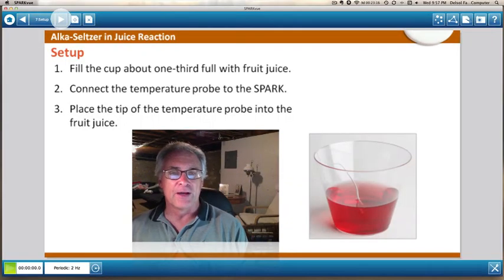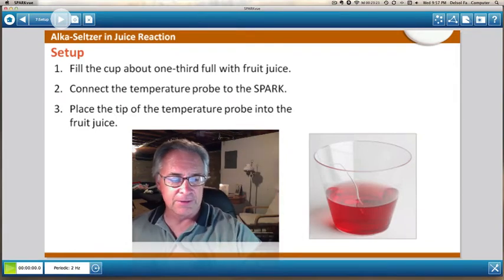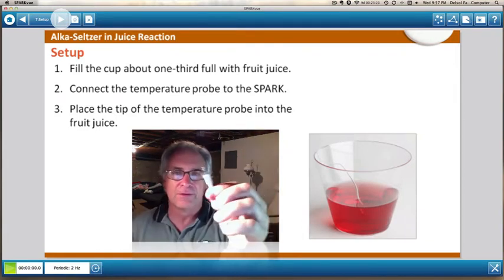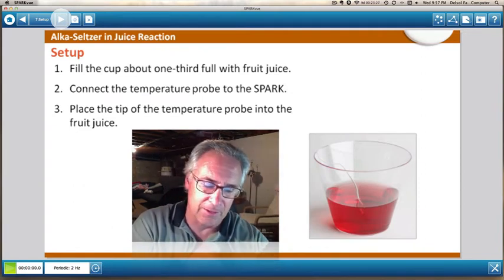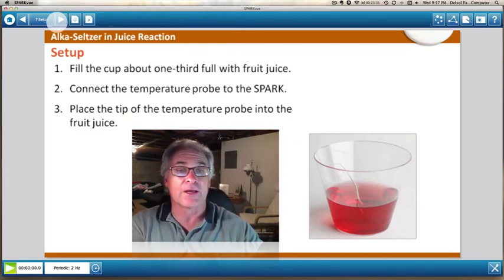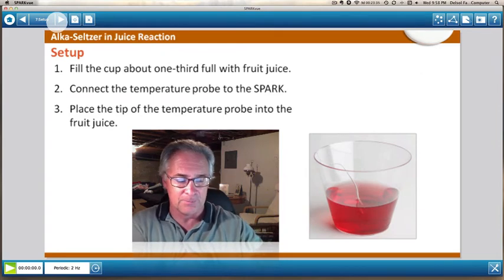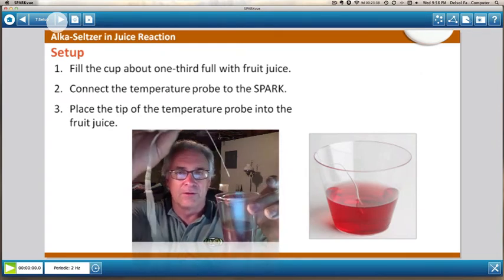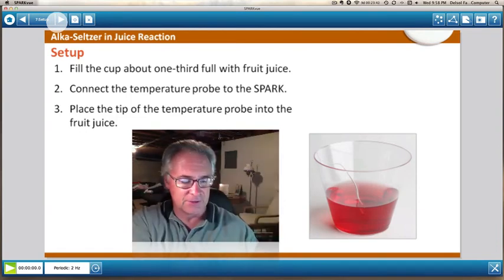All right. We filled the cup up with a one-third amount of fruit juice, just like I did here. We're going to now connect this end of your fast response temperature probe to the data logger. That's what I'm doing right now. And we're going to connect the temperature probe to Spark as we did. And then we're going to place the tip of that temperature probe right into the juice. I'm going to set it down for just a second.